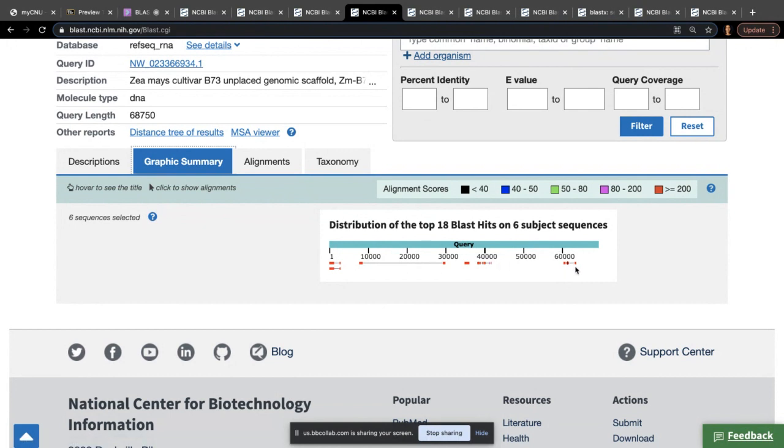5 genes. And this line here connecting means that this sequence doesn't match this part, but this block and this block are the same hit. So if I go slowly, maybe you can read what it says.